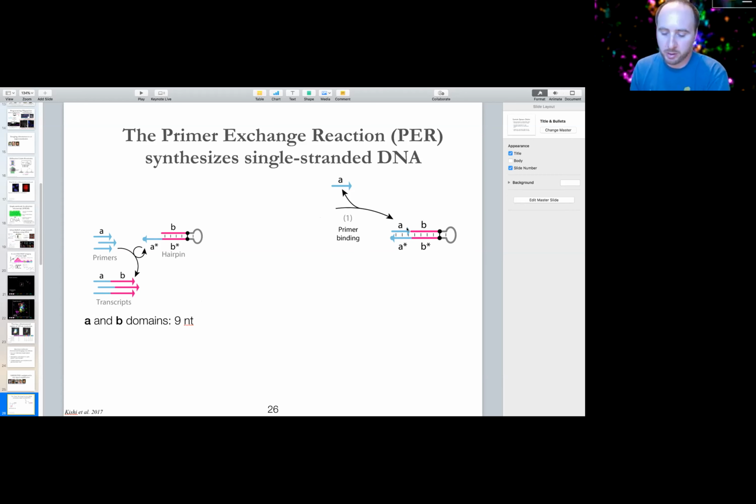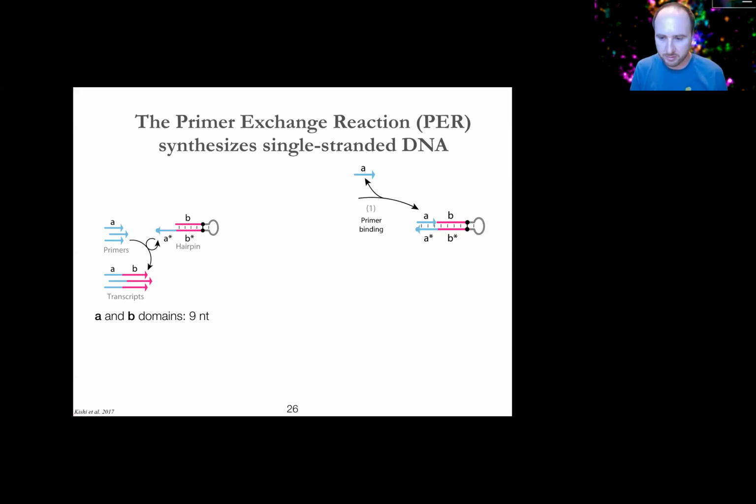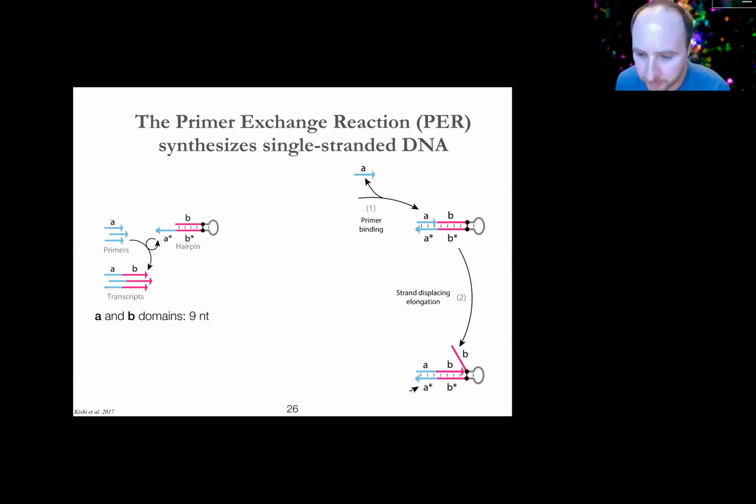So once these two molecules come together, if this happens in the presence of a strand displacing polymerase, you can get extension across the stem loop until it hits that double black dot with a little bar in between. This is because there's a stopper sequence put there. There's a few different ways you can affect this stop. The details aren't super important, so I'm happy to answer questions about that, but for now I'm gonna skip over the minute detail there. Suffice it to say, what's important is that there needs to be a roadblock placed there that stops polymerase from synthesizing any further so it doesn't blow around the stem loop.